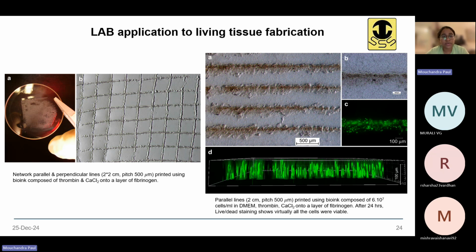Okay, as they are showing with an image, and this is the phase contrast image of that particular pattern. You can see how distinctly, at such a low resolution, you get this pattern.